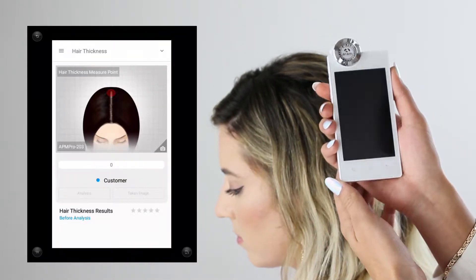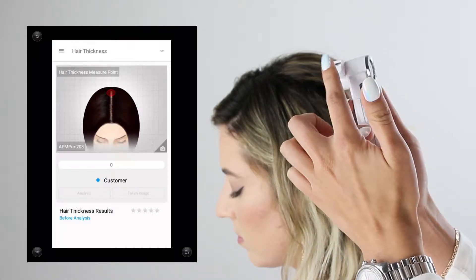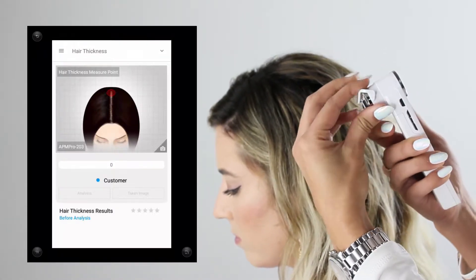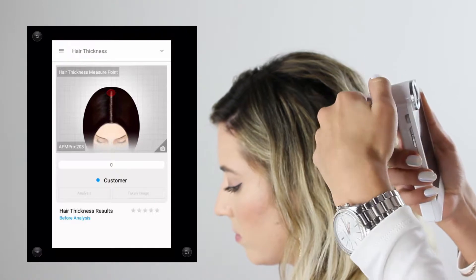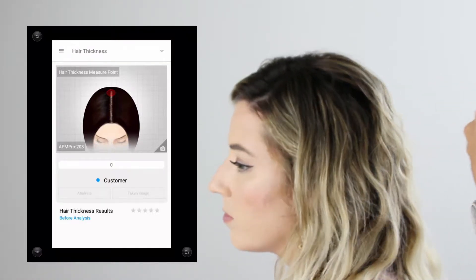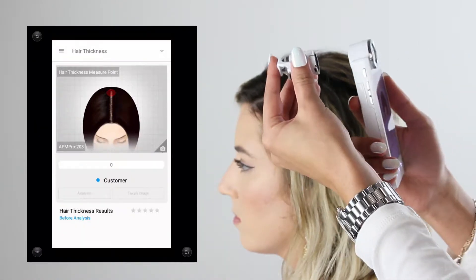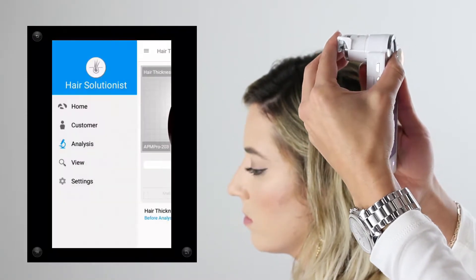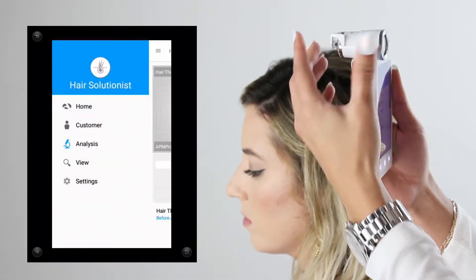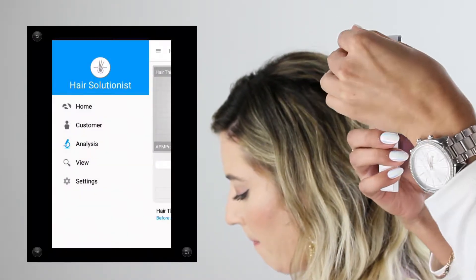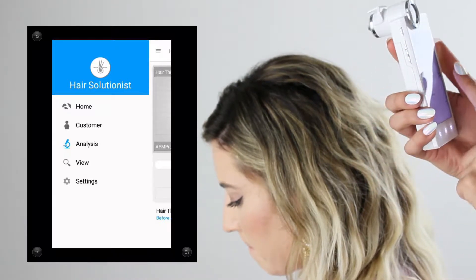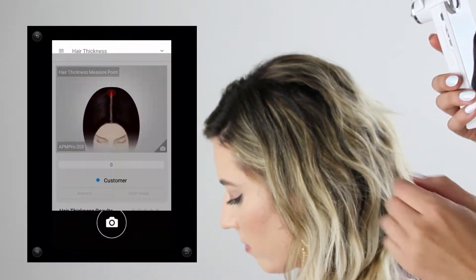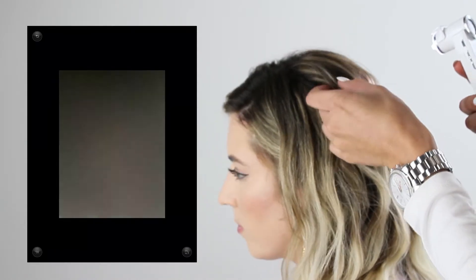To change the lens, press the gray button on the back and it'll pop out so you can switch lenses properly without breaking anything. To put on the new lens, make sure it's facing upright with APM 203 facing towards the ceiling, press the gray button in, and slide the lens in.